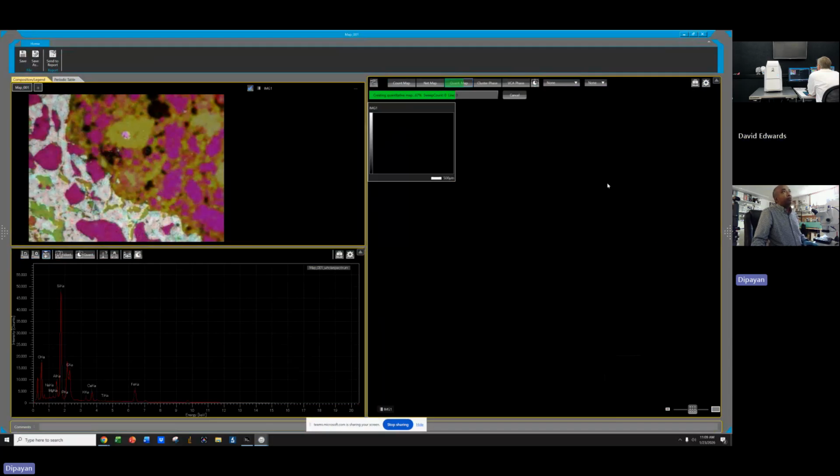And then I'll show you what I do. Let's get this one then. And then I individually go to the major elements, and I right click, and then I play with the histogram. I'll show you. Yes. Yep. I do the same thing. And I found if I don't choose any filter, if I keep it none, I get a very sharp histogram. So I can bring those left and right arrows as close as possible to get the brightest image with no filter.